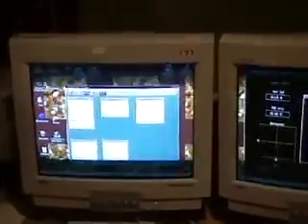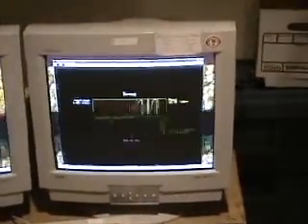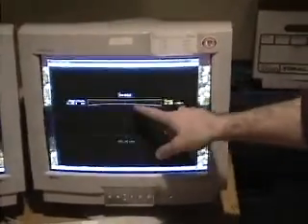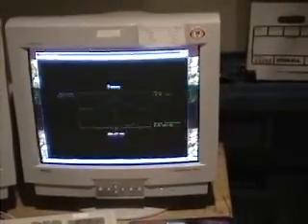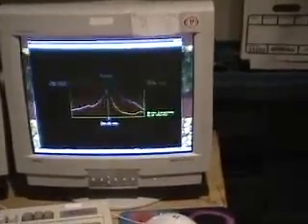Now I want to do that tuning I was just talking about, so I click on the little tuning fork icon up here, and then there are several windows that come up. I just click on the button that says Auto Tune, and if we look back over here, it's showing you the display of the process that it goes through while it's tuning. There are two different traces shown. The white trace is the oscillation amplitude on the vertical axis as a function of frequency. The yellow trace is the oscillation phase as a function of frequency.